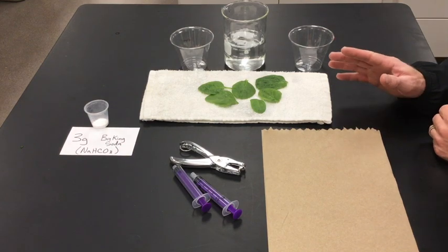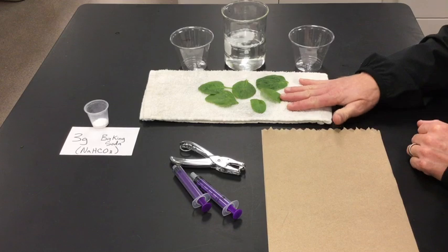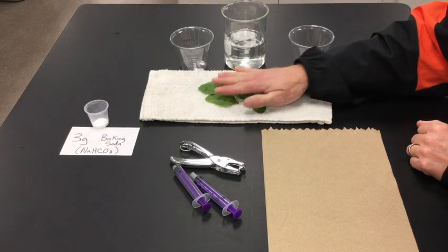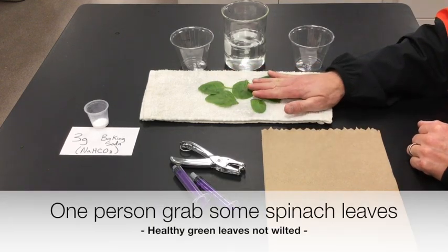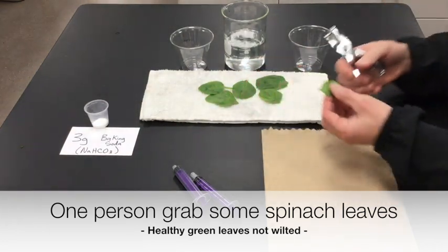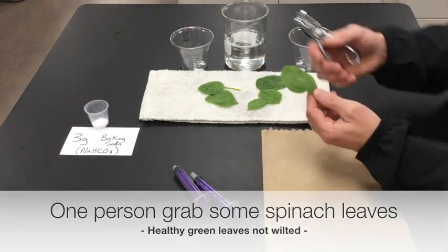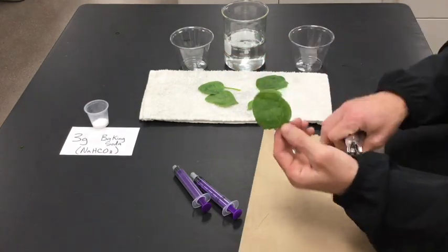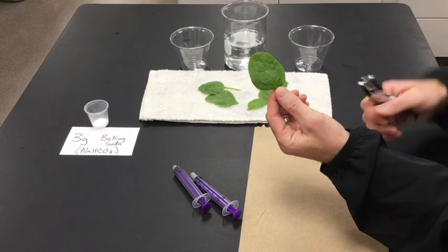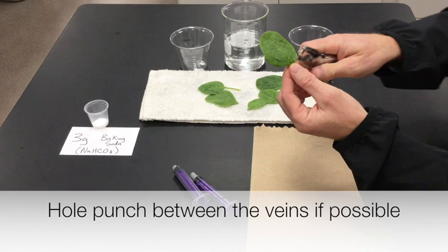To get started efficiently with a group of two, one person should take care of getting a few spinach leaves and getting some of the leaf discs created. Take the hole punch and try to punch out spaces between the veins of the leaf. Try not to punch holes from the veins.